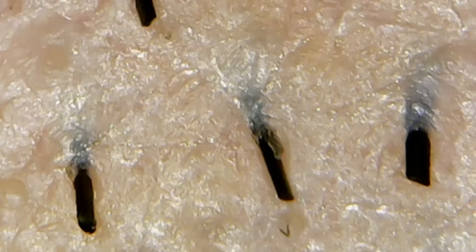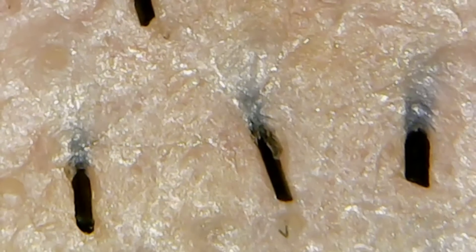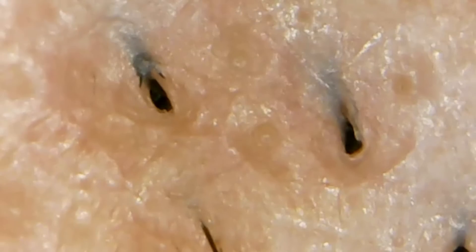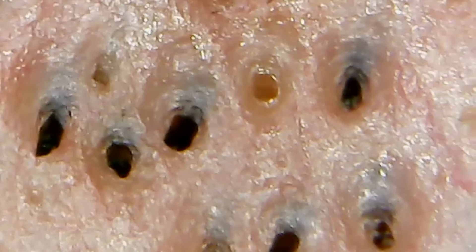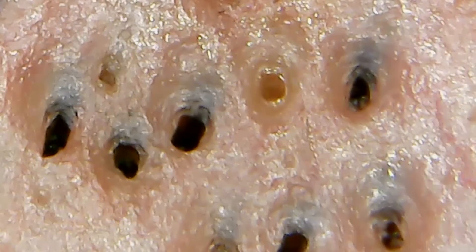The hair is not growing straight, actually it's growing out at quite an angle. One of the remarkable things is the skin looks a little bit transparent, so you can actually see that the beard is growing a few millimeters into the skin. I tried different places on my face and discovered that the characteristics are quite different from place to place.